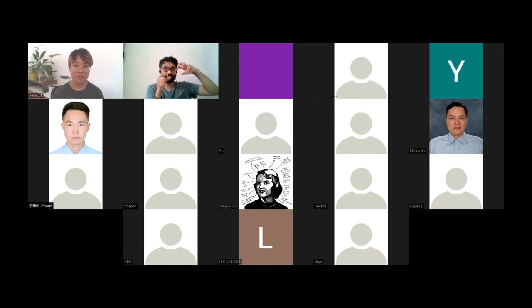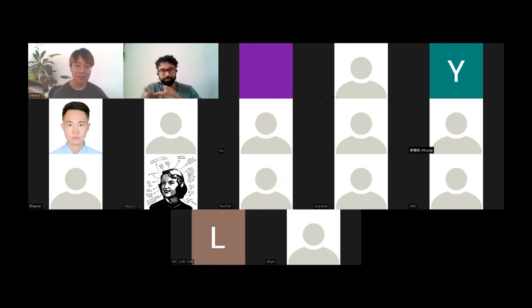So what this is doing is blocking the recruitment of endogenous wild type P53. This is just transient because the single guide RNA is shunted out of the nucleus within 6 to 8 hours if you're using RNP. If you're using plasmid, it's out in 48 hours. So it does not really affect the endogenous capability of the system to actually edit your nucleus or any target. It's recruited through the Cas9 enzyme and also shunted out through the RNP complex of the Cas9.